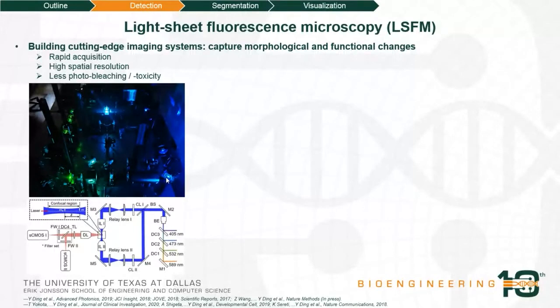As I mentioned earlier, we built an optical imaging system in the lab. We have four different laser lines to illuminate the sample from opposite directions and detect fluorescence perpendicular to the illumination plane. This requires you have strong background and interest in mechanical engineering, optical engineering, and computer science.